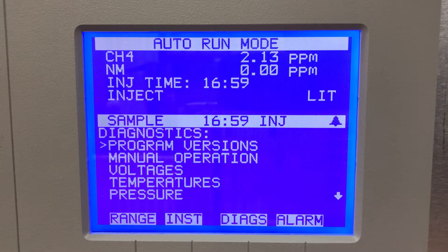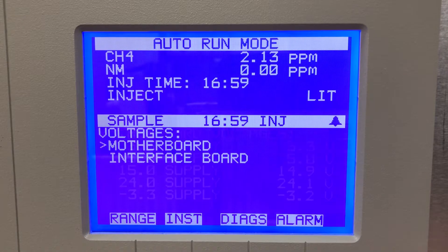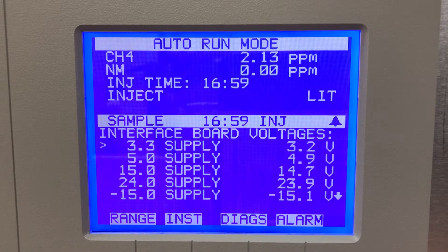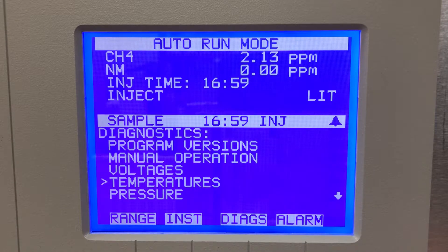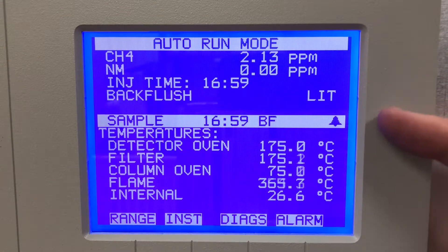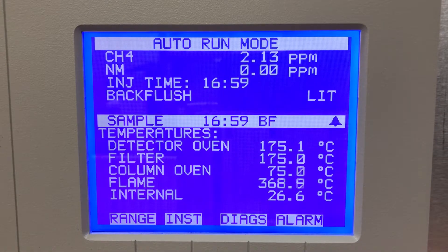It has a good diagnostics menu: program versions, manual operation, voltages — you can look at the motherboard voltages and the interface board voltages, which is good for diagnostics and troubleshooting. Temperatures — which is great because it has a lot of heated temperature zones: detector oven, filter, column oven, flame, and internal. Lots of heated zones in this unit.